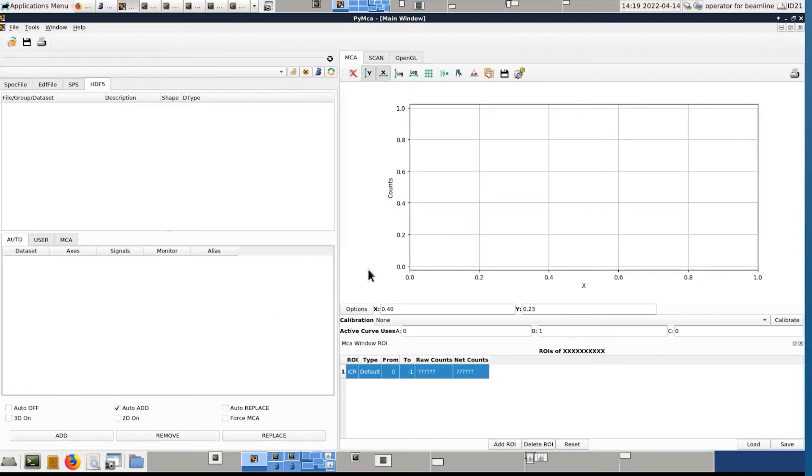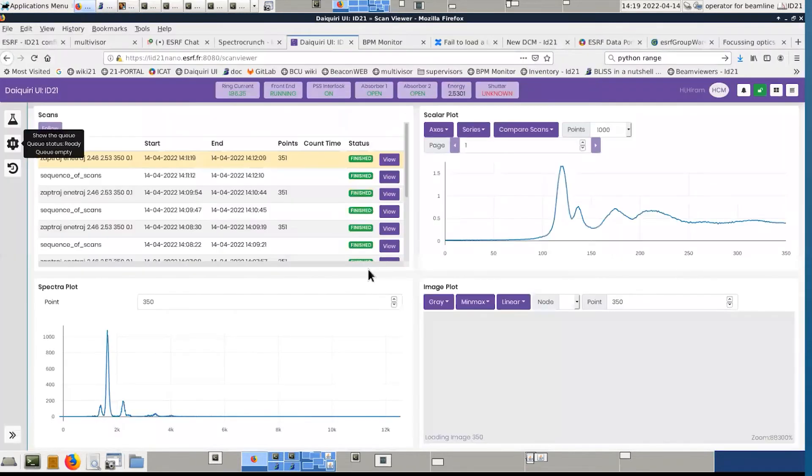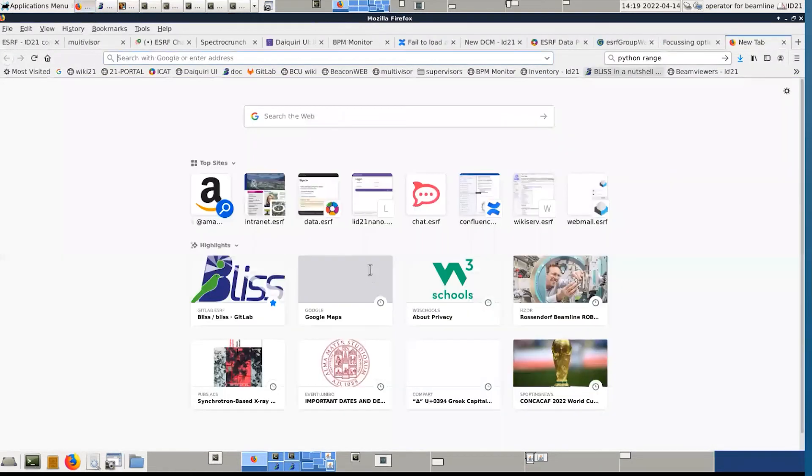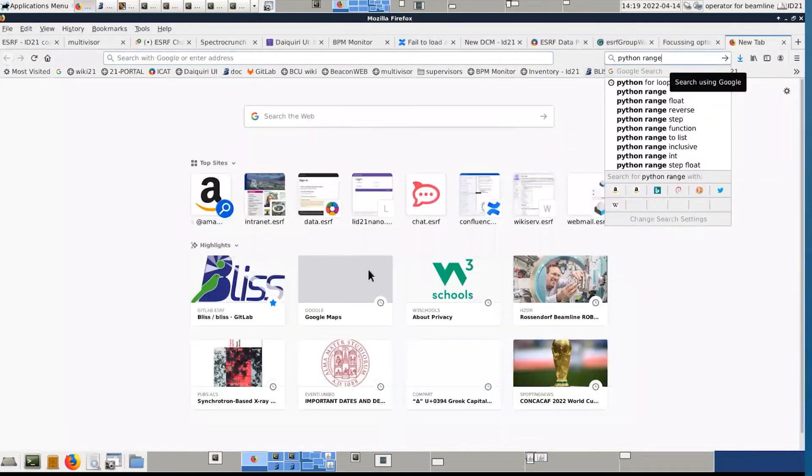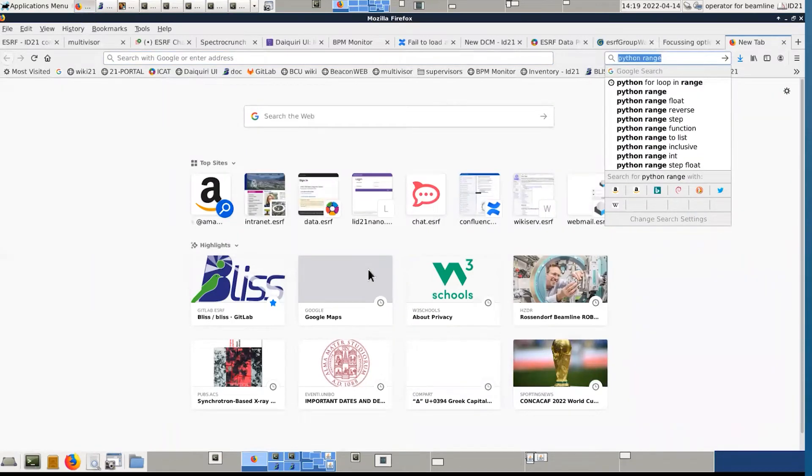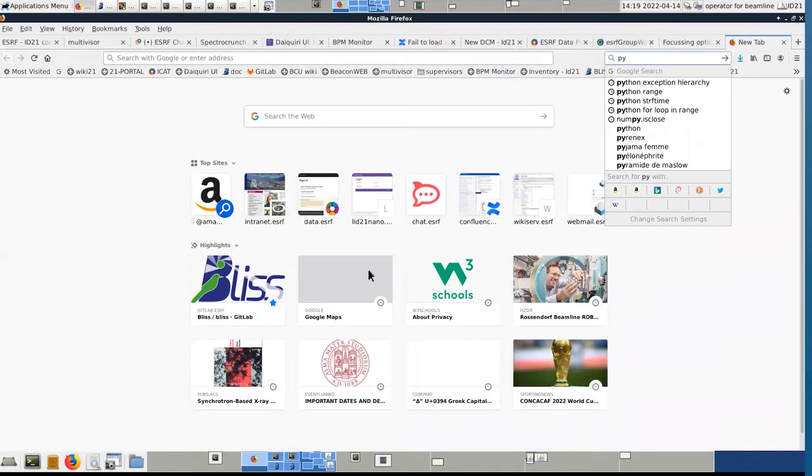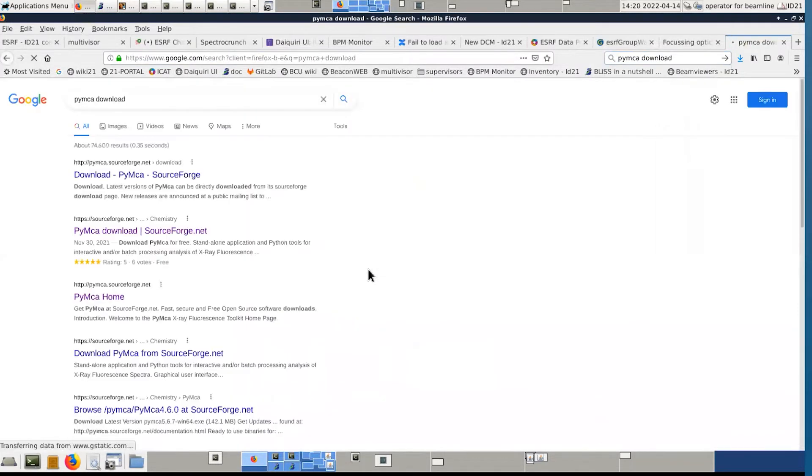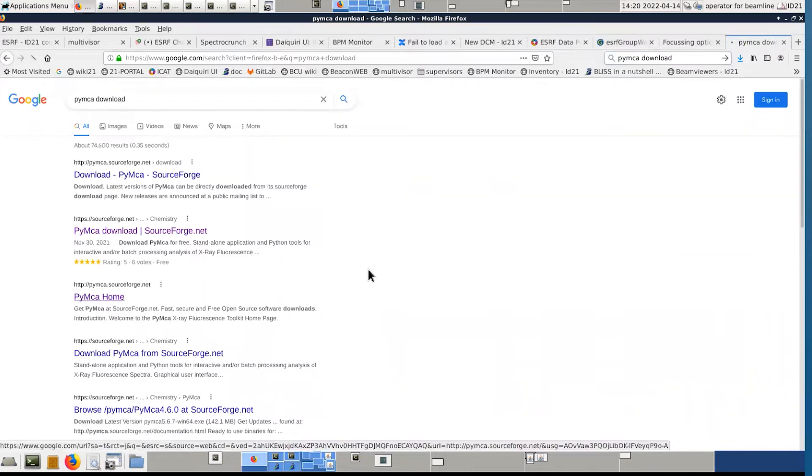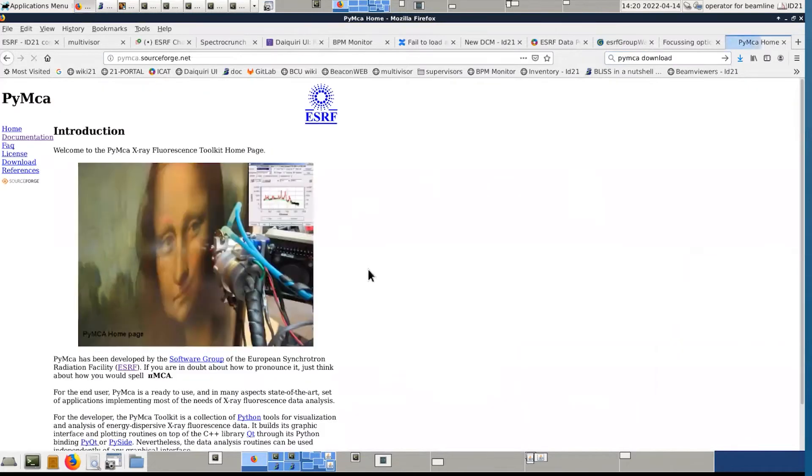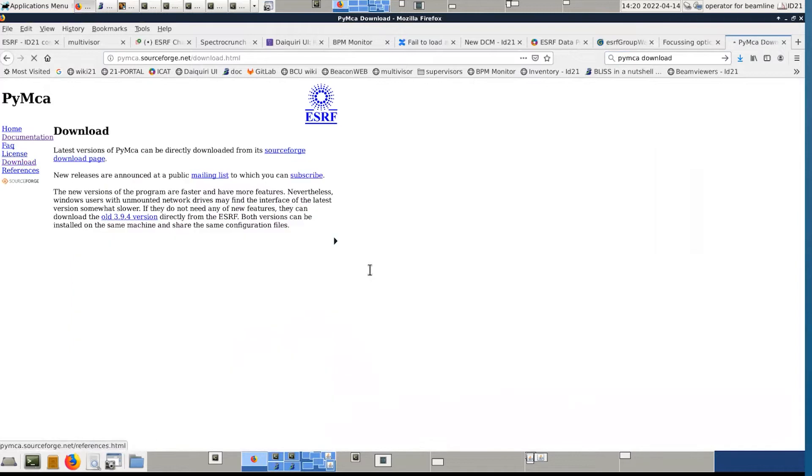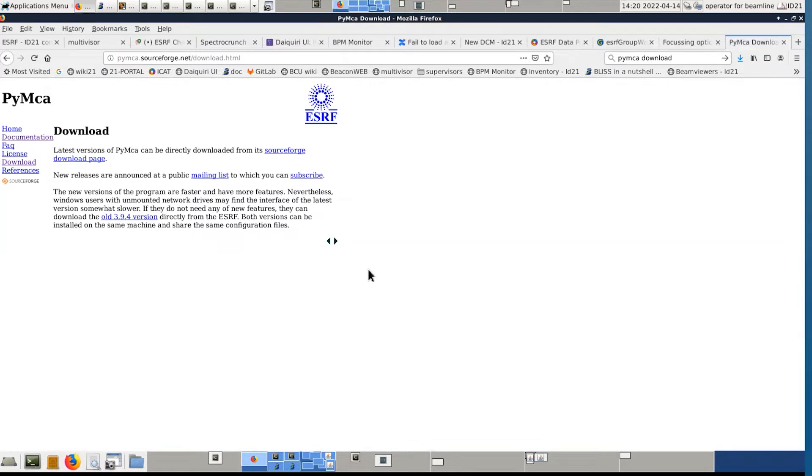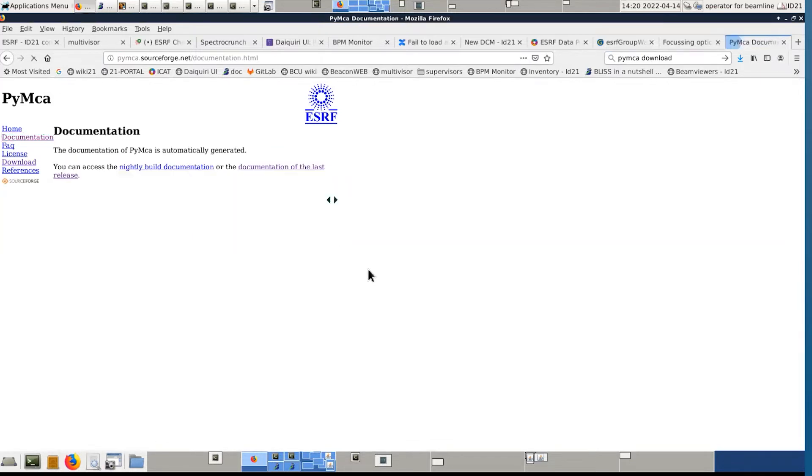For the display and analysis of your data, we are going to use PyMCA. PyMCA is a free software developed at ESRF that you can download on the web. So here you have the main web page, here you can download the last version of the software, both for PC and Mac, and you have some tutorials, explanations and so on.